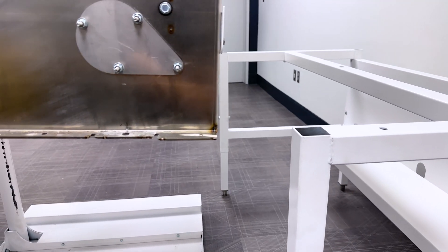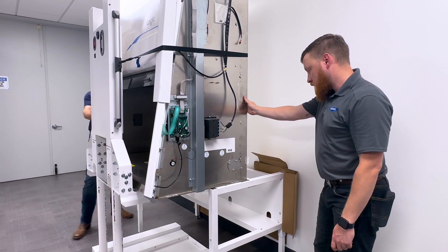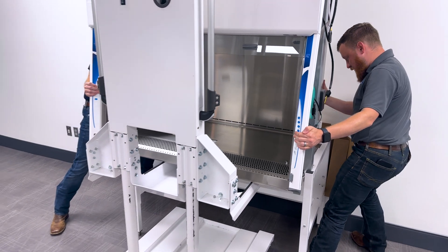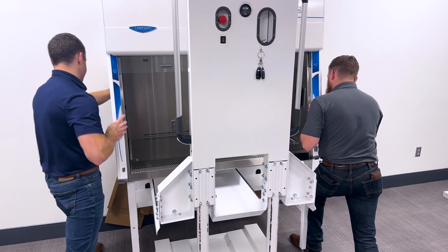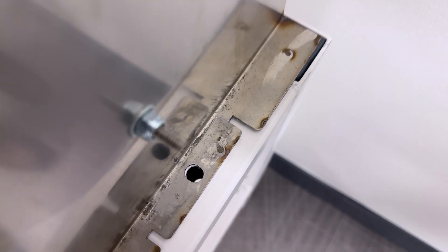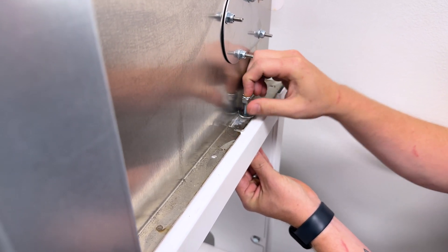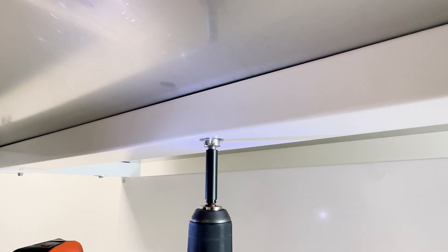Raise the table to the height of the base stand. Using extreme caution, carefully slide the BSC onto the base stand. Next, line up the mounting holes of the base stand with the mounting holes used to secure the BSC during shipping. Secure the BSC to the base stand using the four bolts initially used to secure it to the shipping pallet. Tighten the center anti-vibration brace on the stand so that it contacts the base of the cabinet.